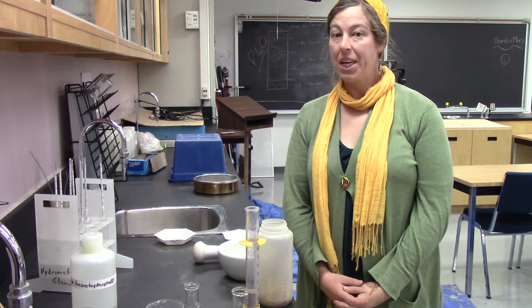In this video I'm going to show you how to make your own Imhoff cone for measuring the texture of soils.